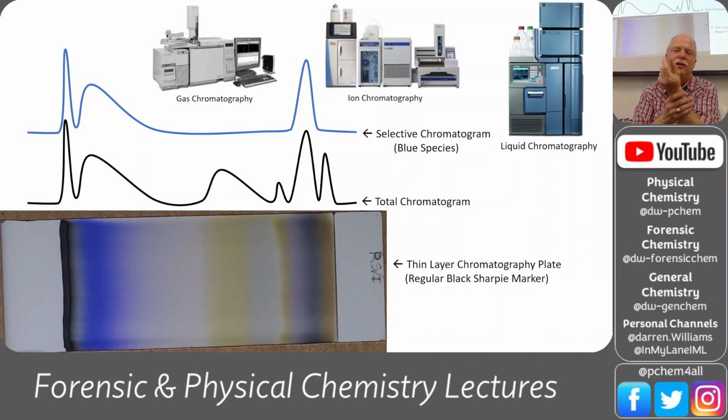And so you've got this hot wire and the gases are going past that hot wire, and when the gas changes from the mobile phase to some other compound, the conductivity of that wire changes, and so you could just plot that. So you get retention time data from a thermal conductivity detector, but you don't get anything that's really connected to the identity of the compound except for the retention time.